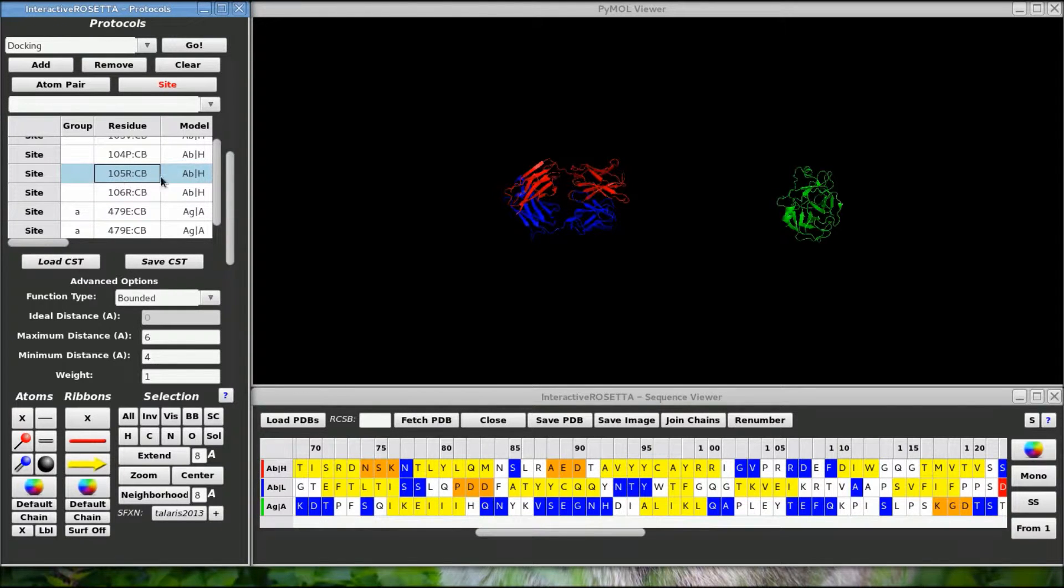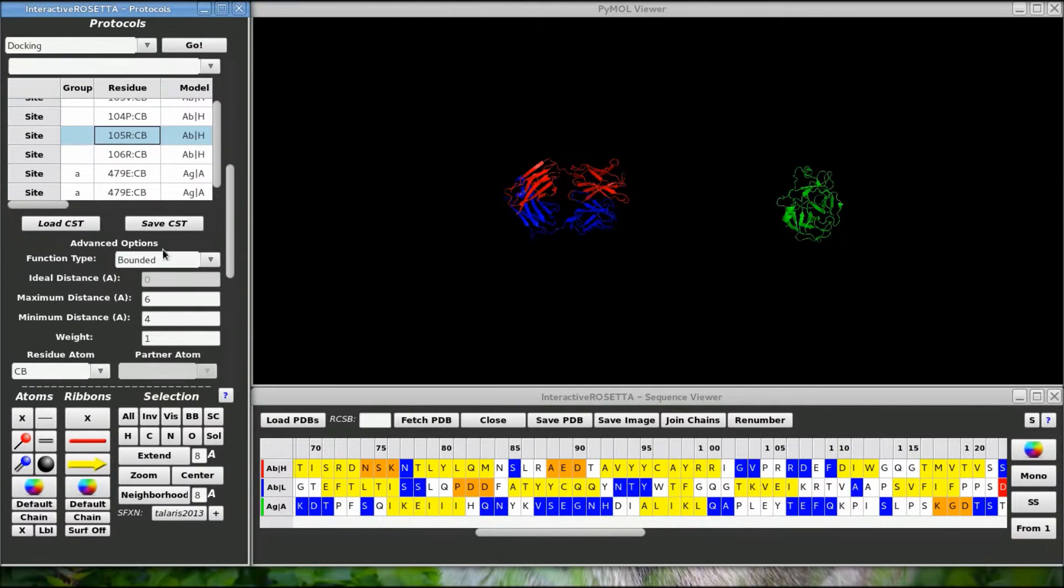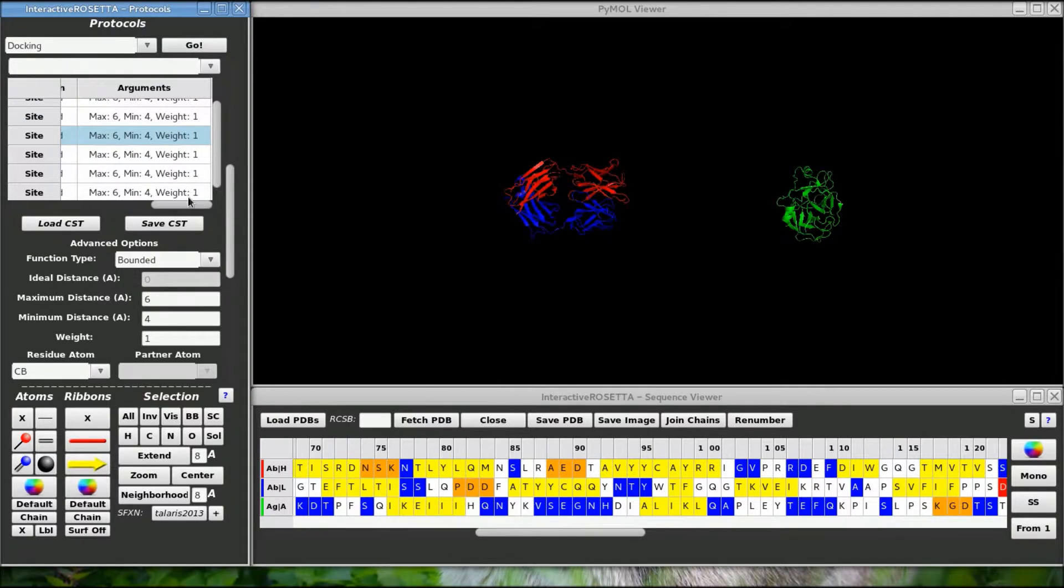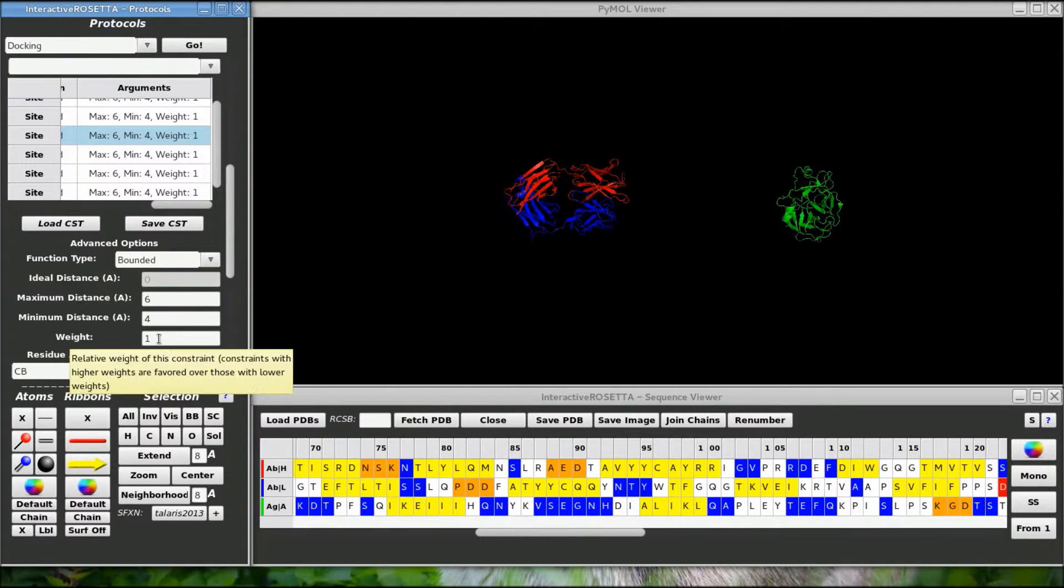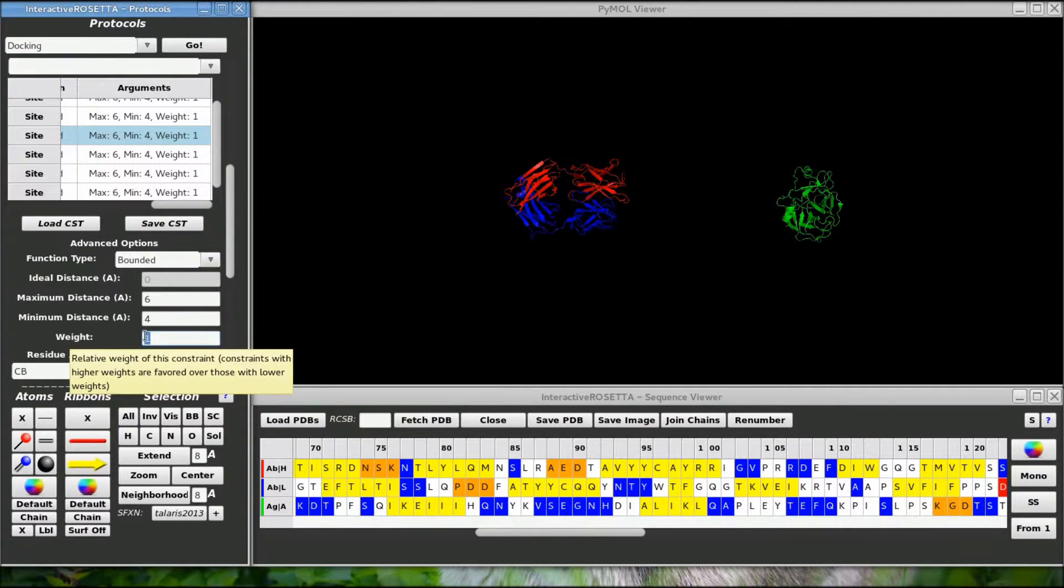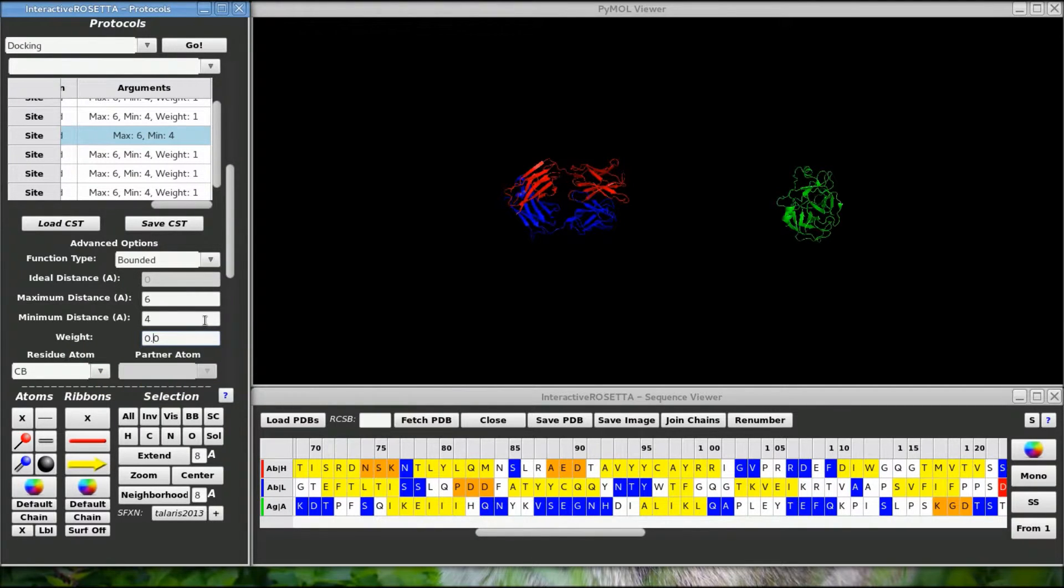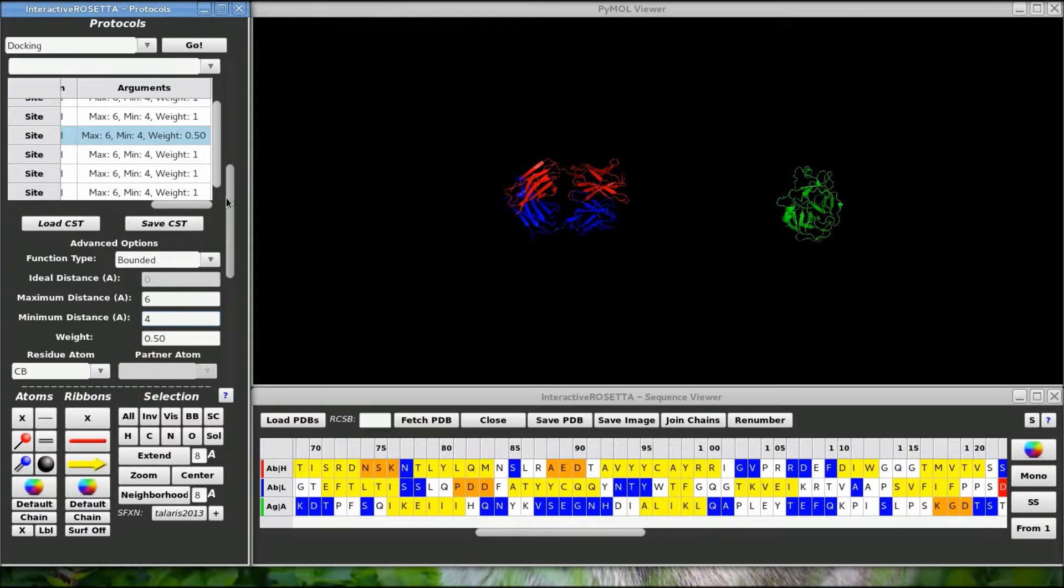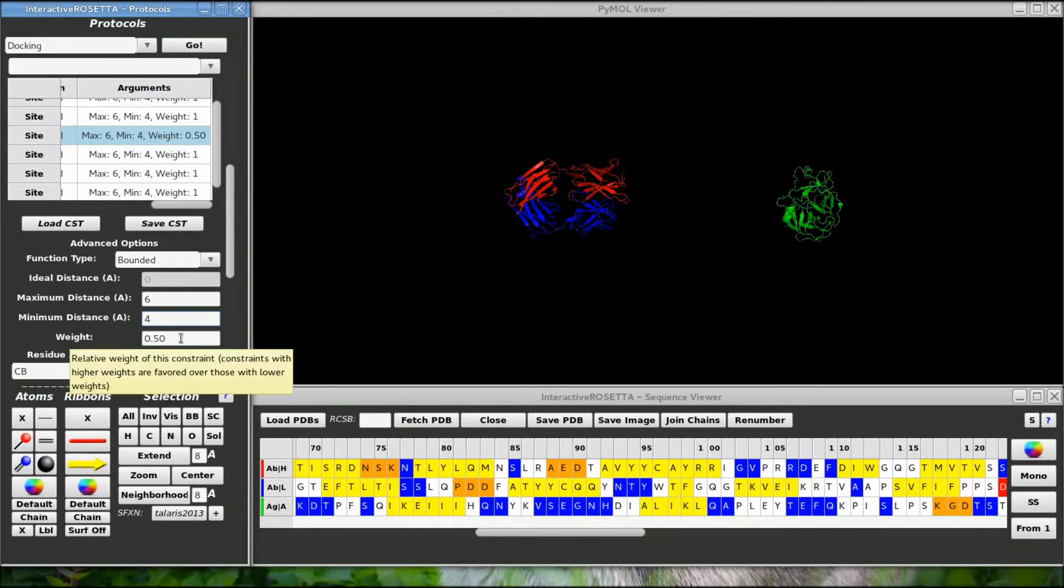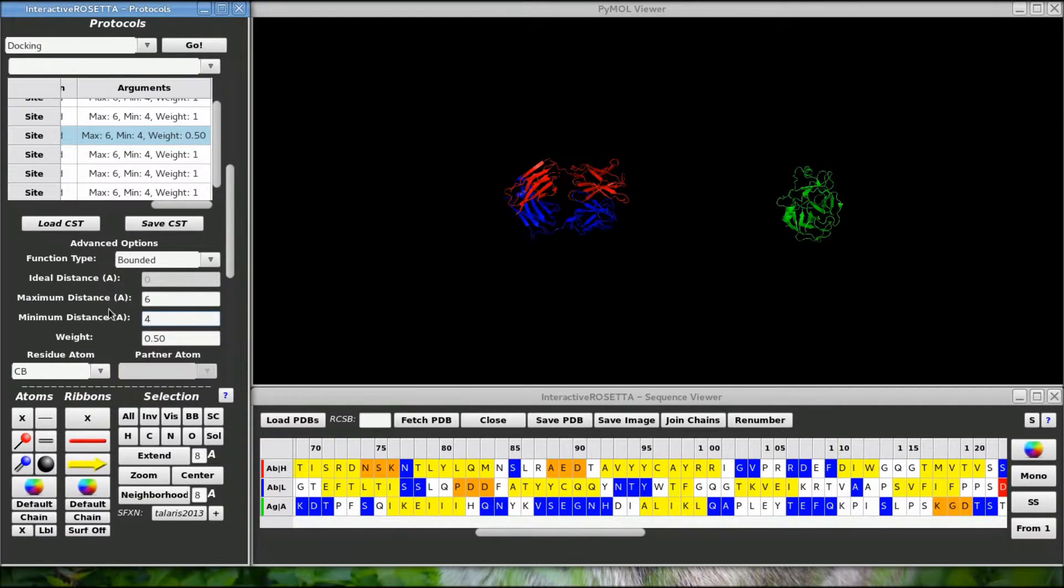What if I was kind of uncertain about this constraint? I don't want it to be weighted as much as the other constraints, so let's click on it and change its weight. It defaults to one but I could change it to a lower value. Now if this constraint is not satisfied it won't be penalized as much as the others. Be careful because if you set the weight value too high you might end up overpowering the rest of the Rosetta scoring function in favor of the constraints, which will not give you good results.